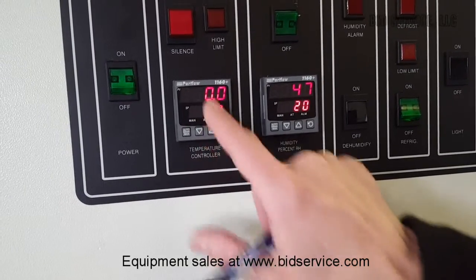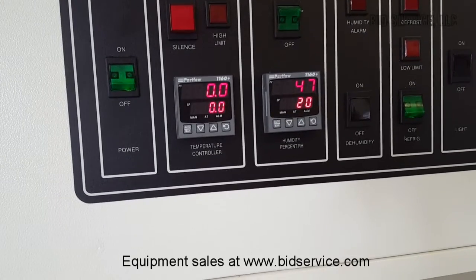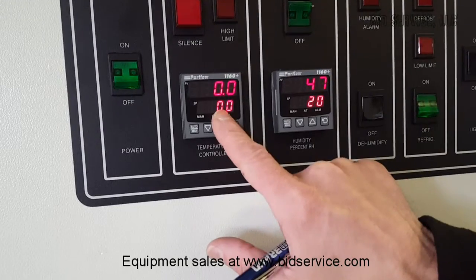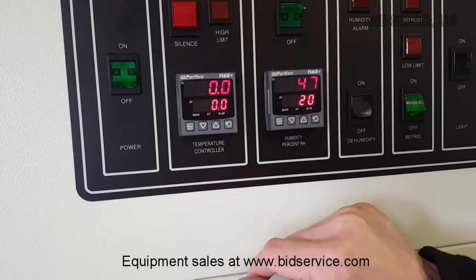Again, these are single set point controllers — Partlow 1160 plus. Right now I have it set to zero degrees, I have the humidity off, so we're getting zero, which is the low range of the chamber, which is zero degrees Celsius.